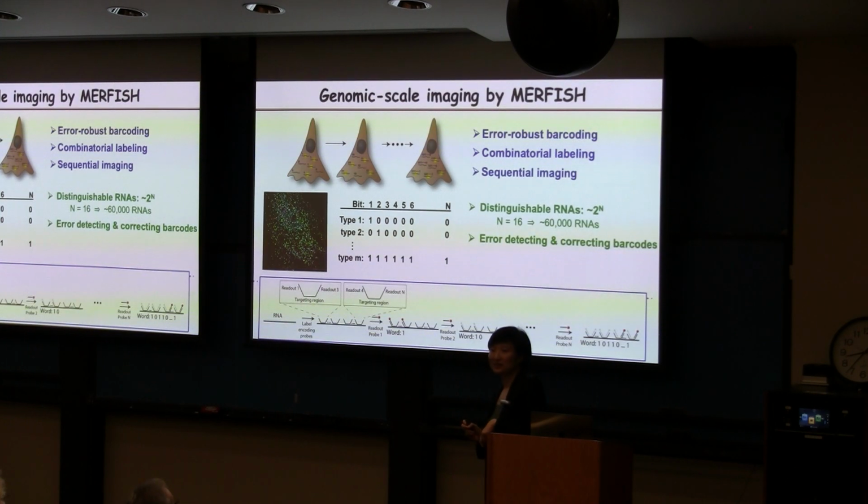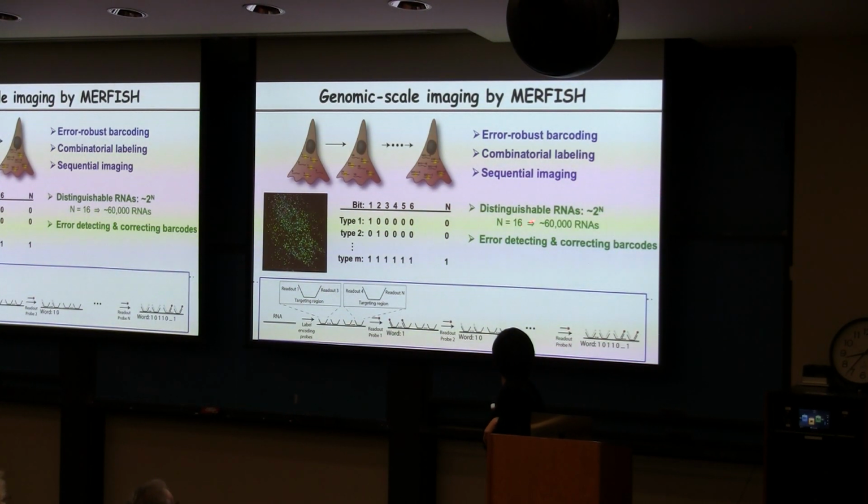This caveat essentially says what I just said here is a bit too good to be true, because there's error in every kind of measurement. Okay, I said the single molecule FISH can be extremely accurate. Let's say if it still has 5% error left. For imaging one kind of RNA molecule, that's of no consequence. But that means every bit has 5% error. Now 2 bits has 10% error, 3 bits has 15% error. They add up. So you can quickly misidentify molecules.